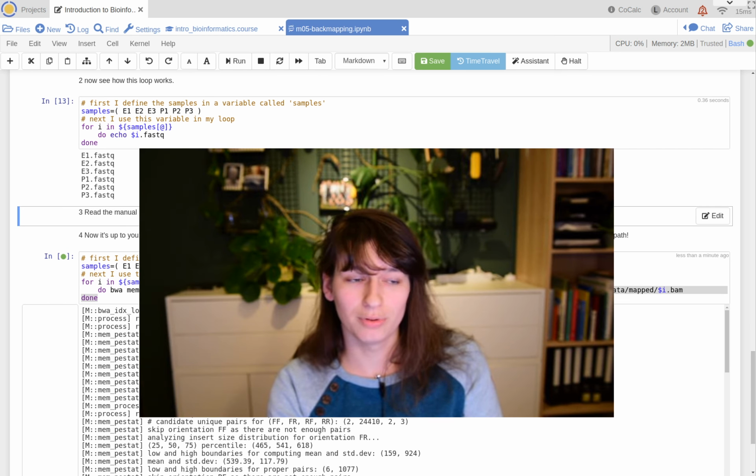So why do I want to do that? For all the scaffolds, all the pieces of DNA that have a similar abundance of DNA mapping on there, I can then conclude that these were more abundant in the sample that they were sequenced in. So this gives me a biological signal. A lot of technical steps, but all towards an end, a biological signal, information about our data.